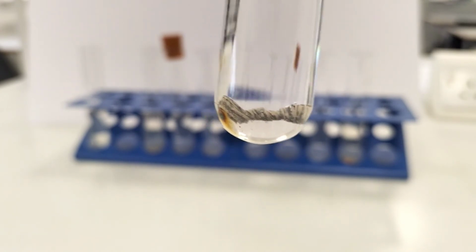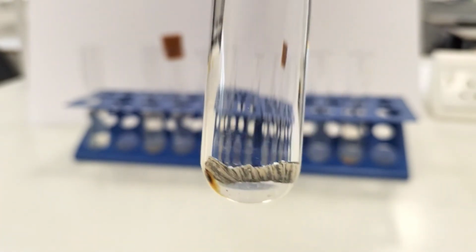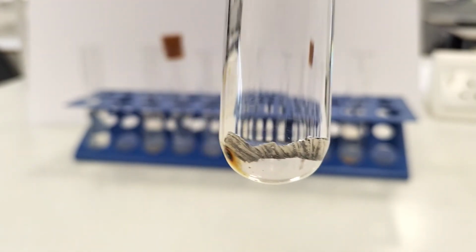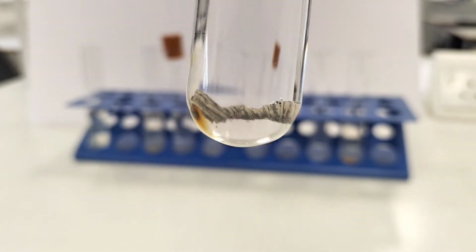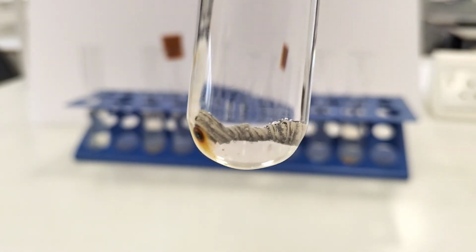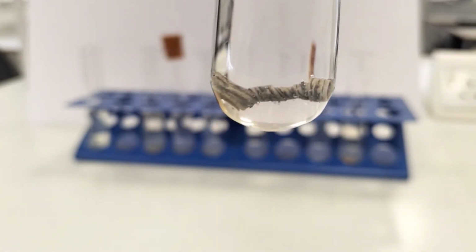So that magnesium metal is actively protecting all the surrounding iron atoms and preventing them from rusting because it's the more reactive metal. There is a little bit of rusting going on, and that's probably down to the fact that magnesium is quite a lot more reactive than iron, and maybe the magnesium at the very end here has been exhausted, has done its job, has all formed magnesium oxide, and there's no more magnesium in close proximity to that iron to keep protecting it, and a little bit of rusting has been allowed to occur. But magnesium's done a pretty good job of protecting the iron.